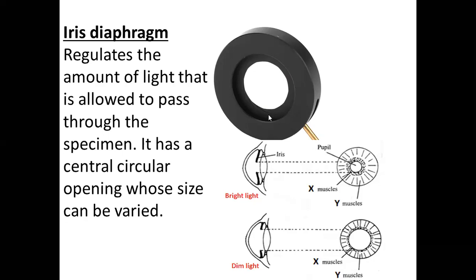You can see this part, it's like the parts are overlapping. The moment you operate this lever, this is called a lever, the moment you push this lever up, these overlapping circular areas are going to close, or they are going to alter the size of the opening here. They are going to either increase or decrease the size of the opening.